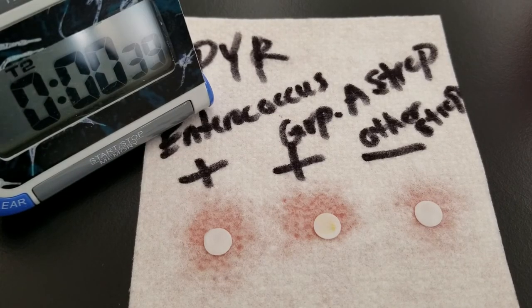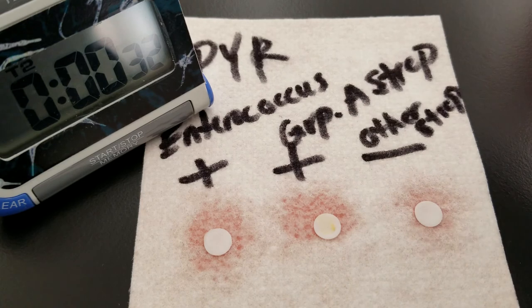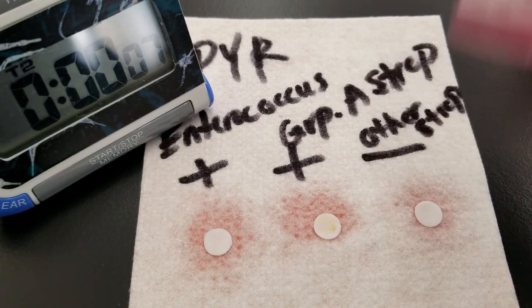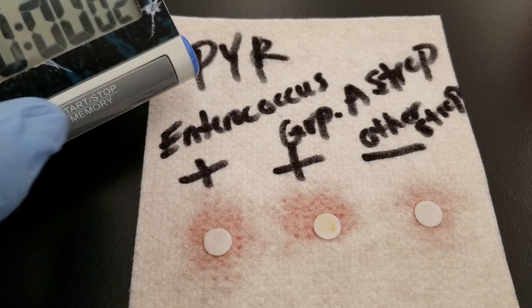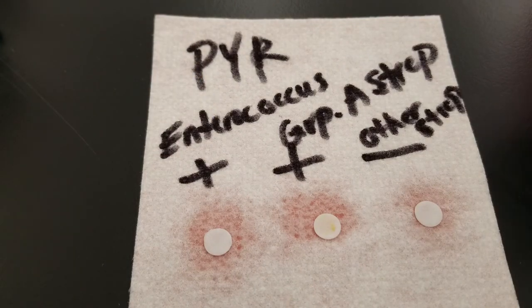While we're coming to a close, I want to show you the color developer — it is going to turn the new compound red if the enzyme was present, and will not change color if the enzyme was not present. We're going to swirl it, and then add a drop to each of these and observe for one minute in order to see if it turned positive.